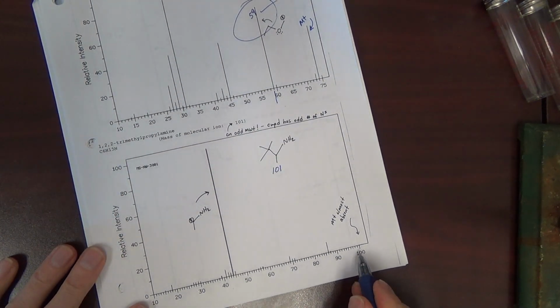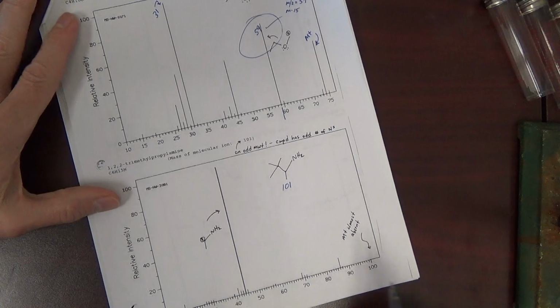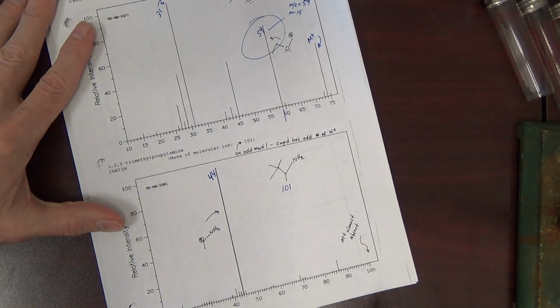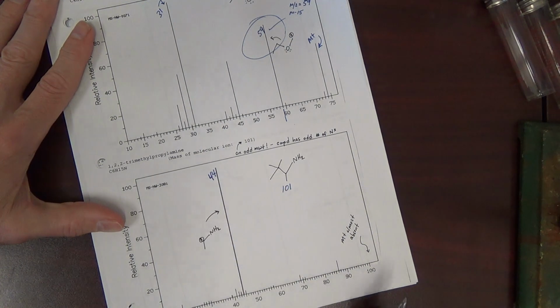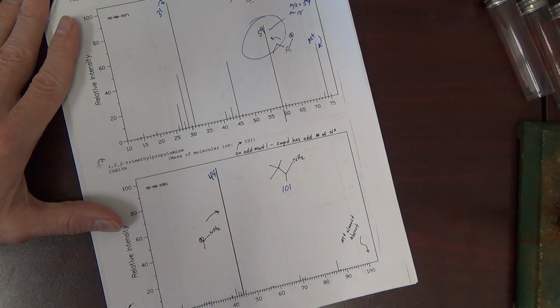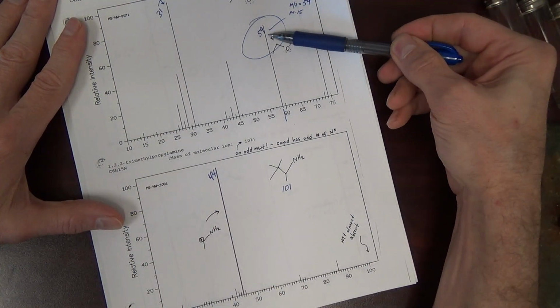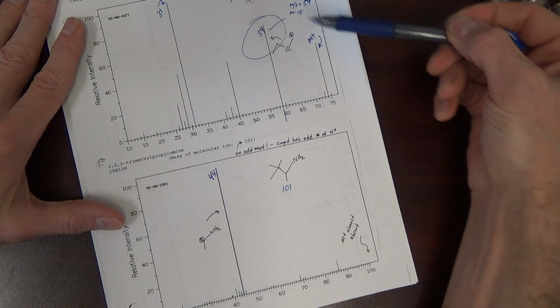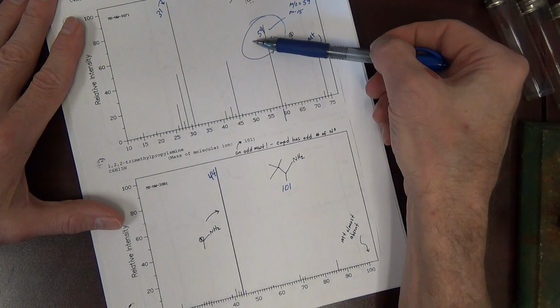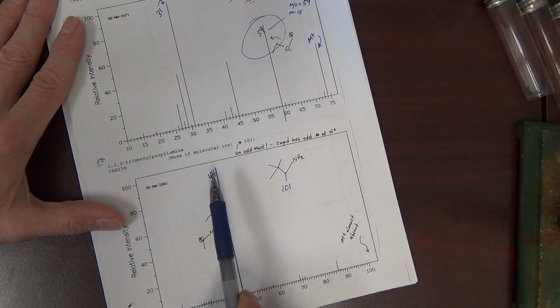Okay, so molecular ion mostly absent. What type of cleavage peaks do we have? We have this peak at 44. By the way, this is our first major peak that we've been looking at that has an even molecular weight. That goes again with the nitrogen rule. Above, no nitrogens, even molecular weight, all the cleaved cations were odd. On the other hand, if you have an odd number of nitrogens, your original molecular weight will be odd, but all of your cleaved cations will be even.